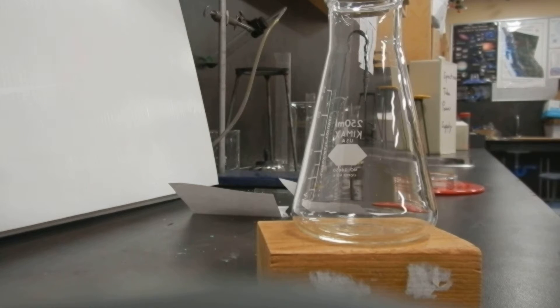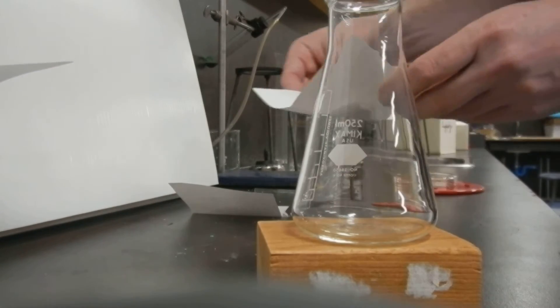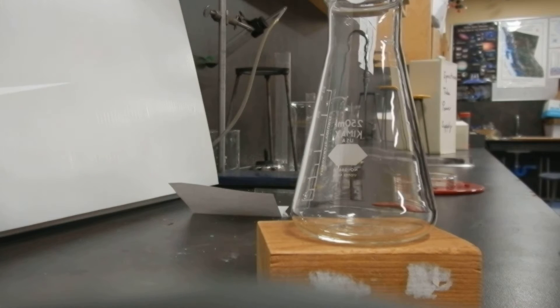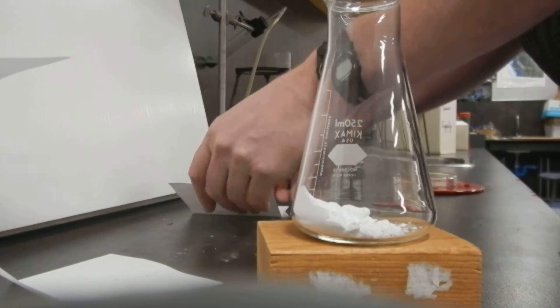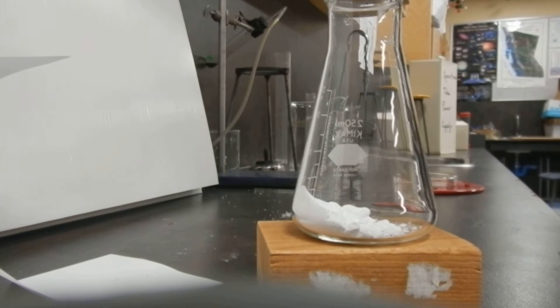I'm going to dump the two white powders together. So one of these powders, this is barium hydroxide. So I'll put it into the flask. And then I have some crystals of ammonium thiocyanate.